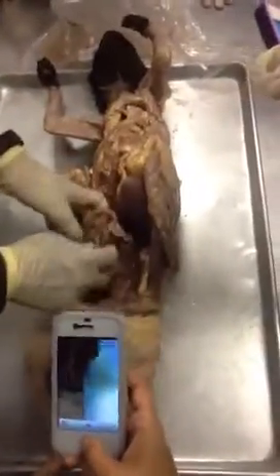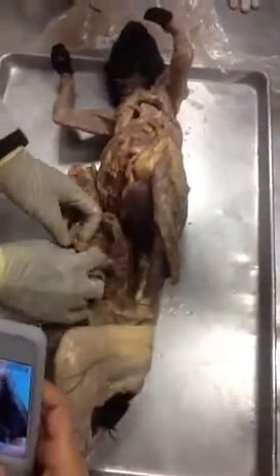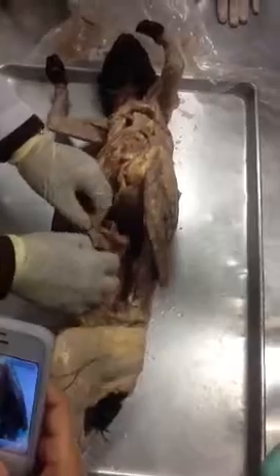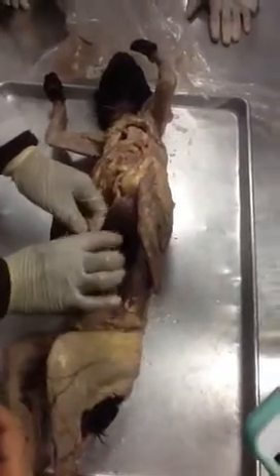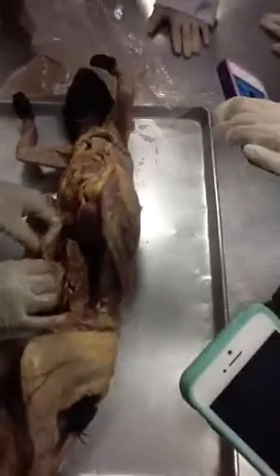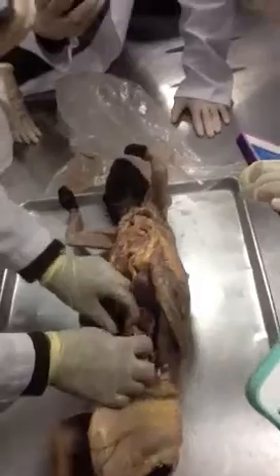We have got two types of intestine. One is called large intestine, another one is called small intestine. The small intestine is actually longer than the large one, but the caliber is smaller. So that's why we call it small intestine. So we are holding the small intestine, alright?